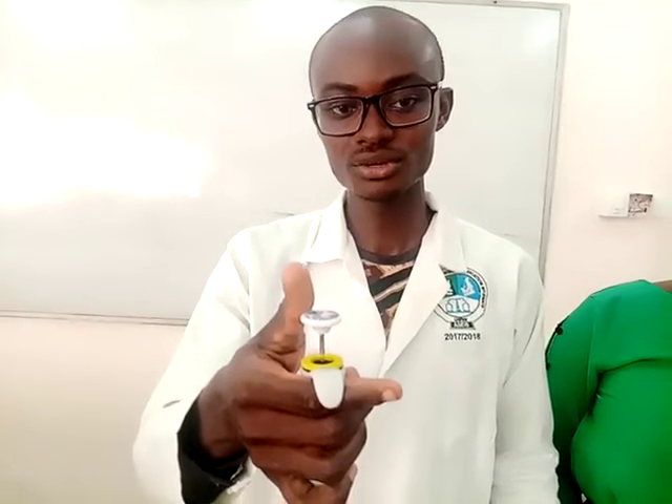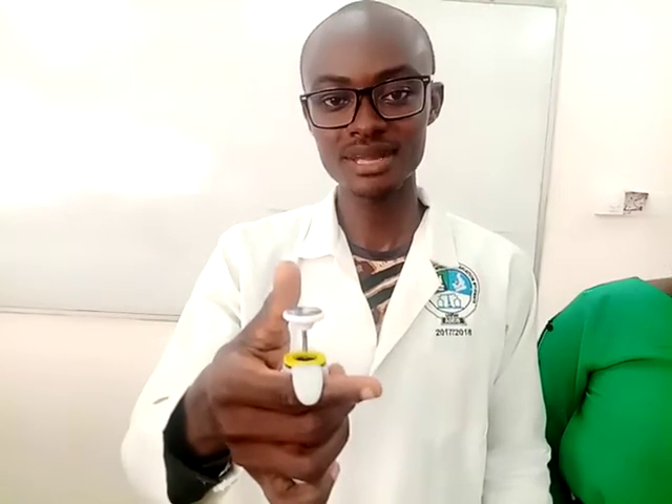Now these positions have their functions. The first position is used for picking up the volume of the solution that we are going to measure, and also used for delivering the same solution. The last position is used for dispensing the entire solution remaining in the pipet tip.